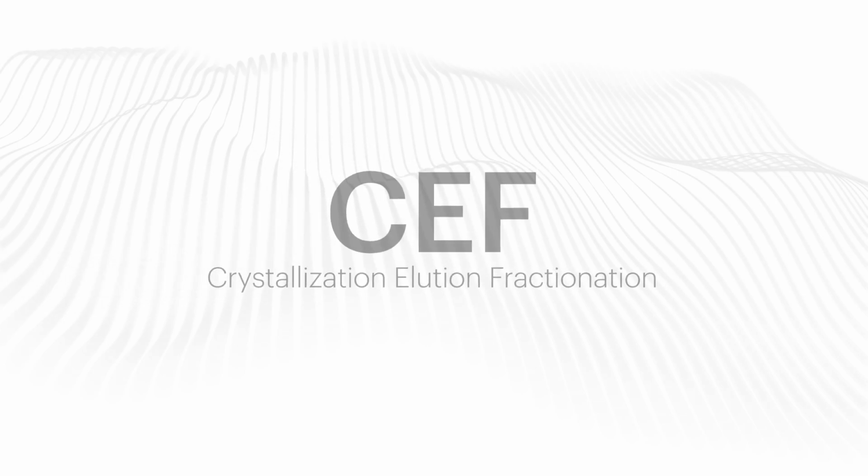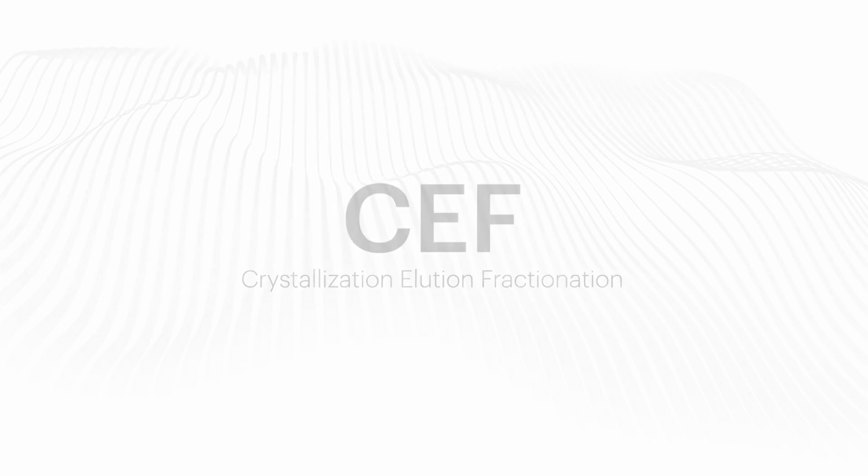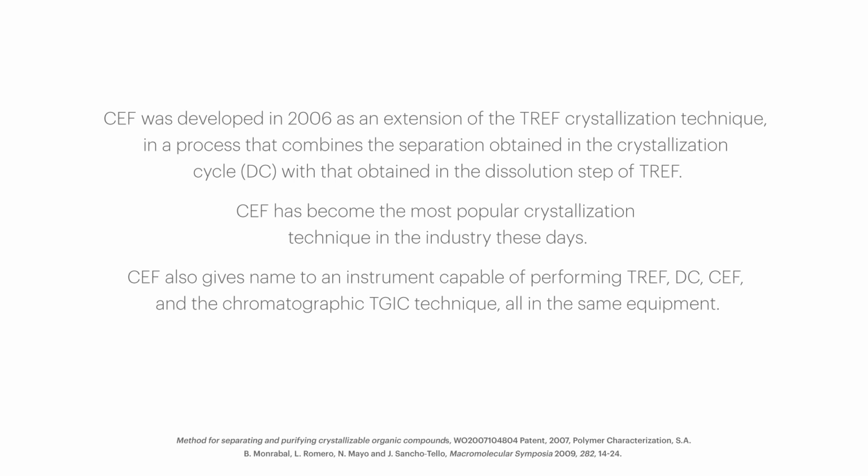CEF, crystallization elution fractionation. CEF was developed in 2006 as an extension of the TREF crystallization technique in a process that combines the separation obtained in the crystallization cycle of DC with that obtained in the dissolution step of TREF.